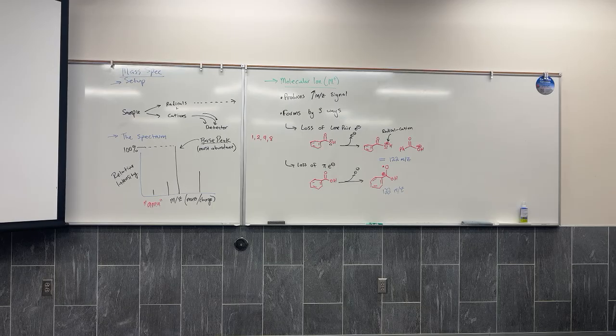This carbon has 3 bonds, one of them to the hydrogen, and it has 1 electron. If you did the formal charge calculation, that's dots plus bonds, 1 dot and 3 bonds, 4 minus 4. If they both have a radical, then they're not charged, and you haven't actually lost any electrons. You just took the pi bond and split it into radicals.